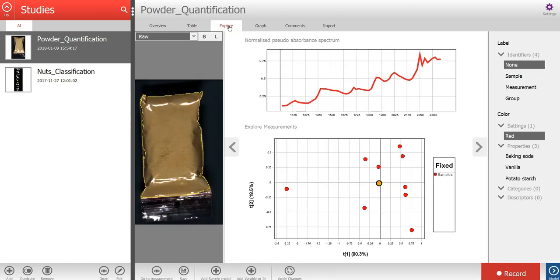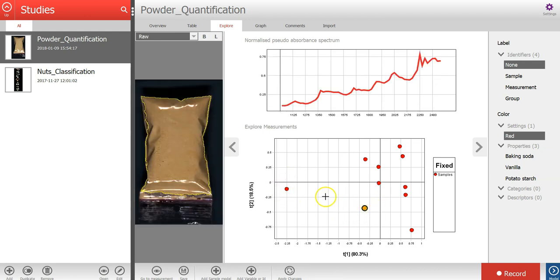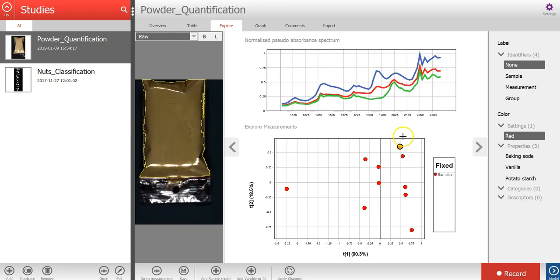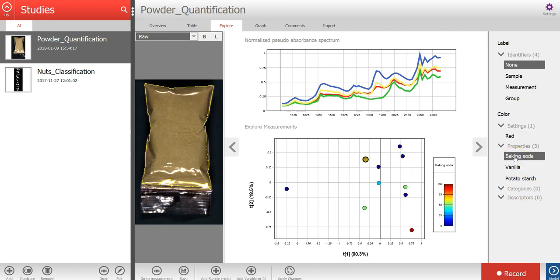A PCA model has here been created based on the average spectrum for each sample. In the menu on the right, I can select to color the scatter plot based on different property values.